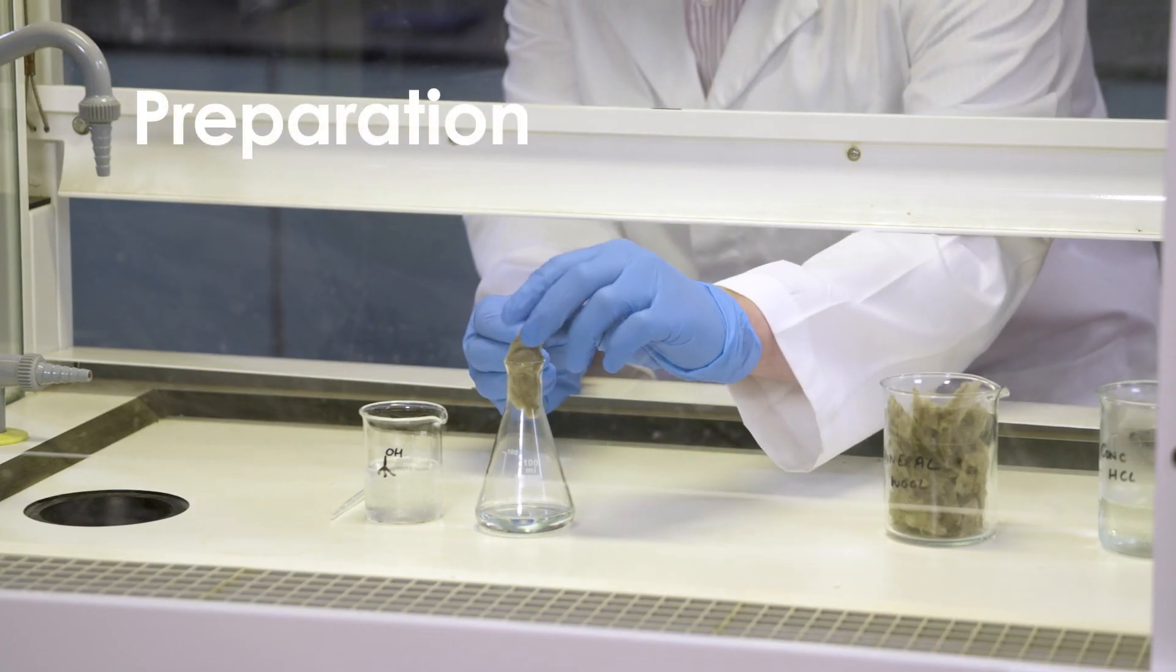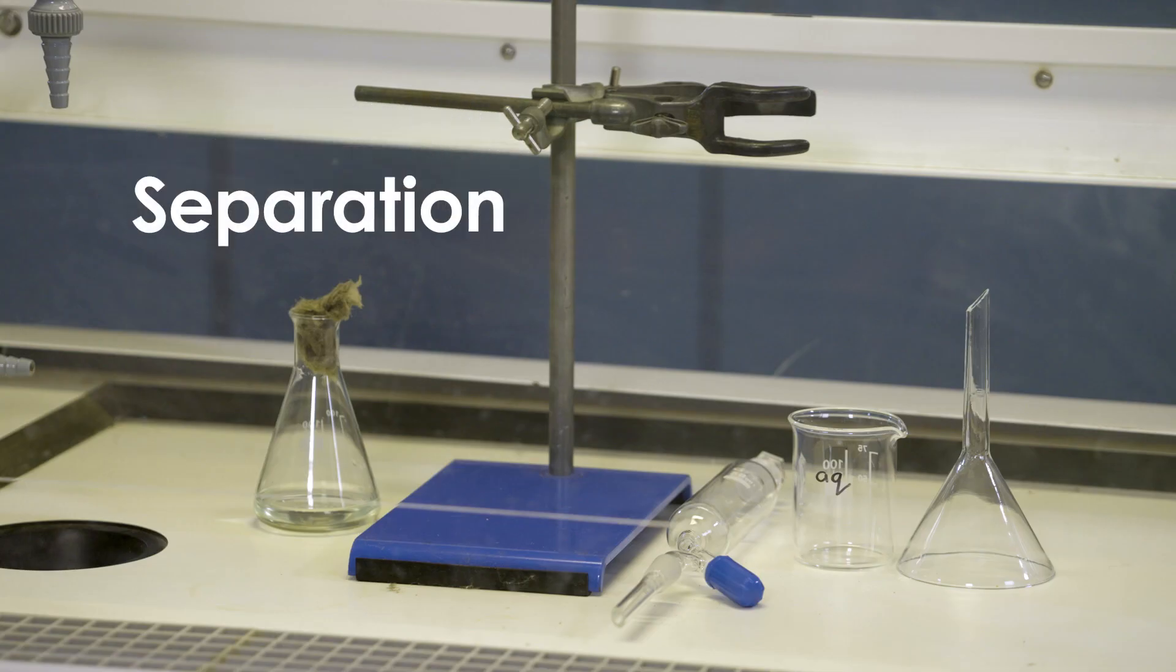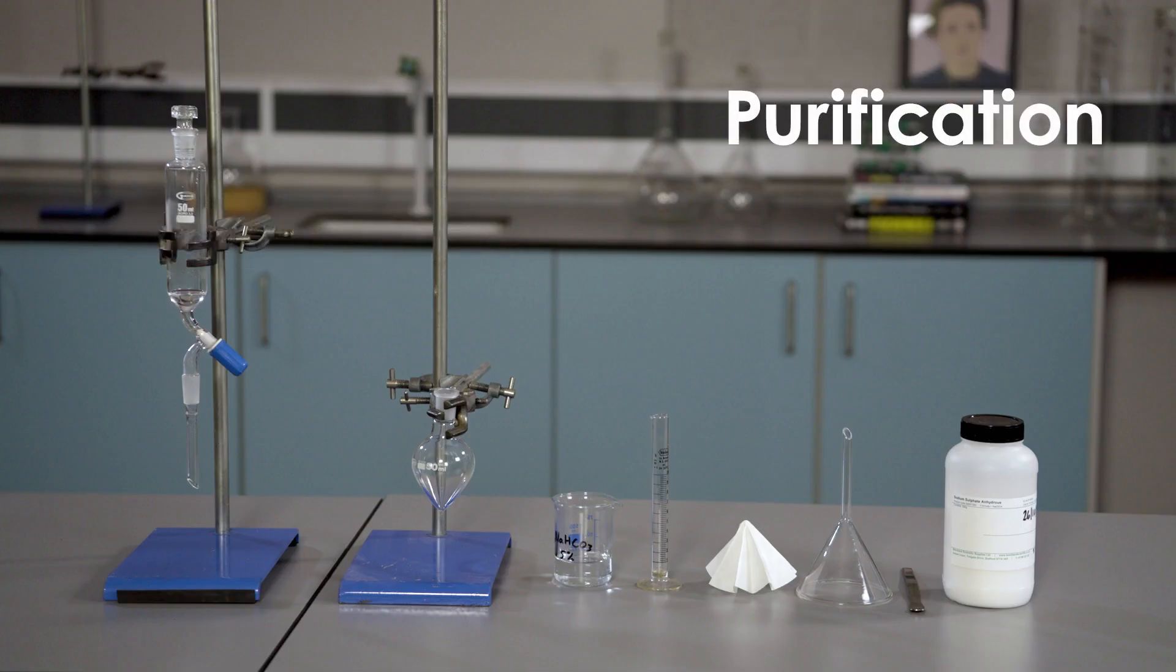Preparation, where we complete the reaction to produce the desired product. Separation, the important step of getting the bulk of the product away from any unreacted starting reactants, byproducts, and often importantly water. And finally purification.